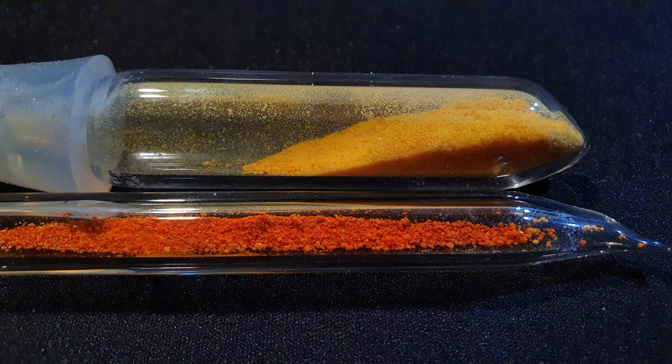Here you can see the superoxide on the top compared to the ozonide at the bottom. Pure cesium ozonide can be stored at minus 20 degrees C for several months, but sooner or later it will decompose to form cesium superoxide and oxygen.